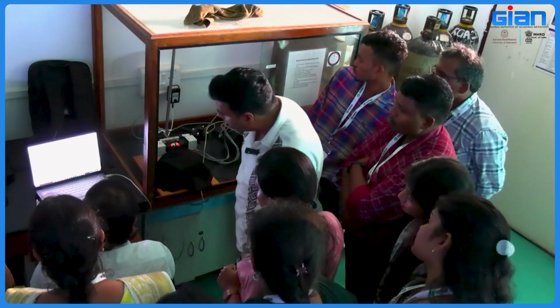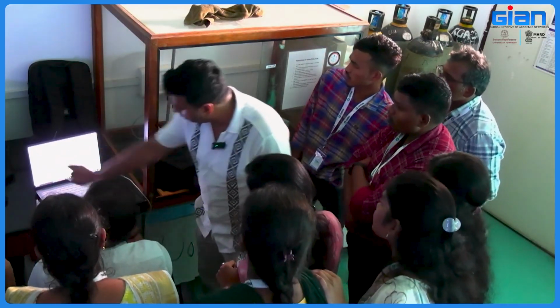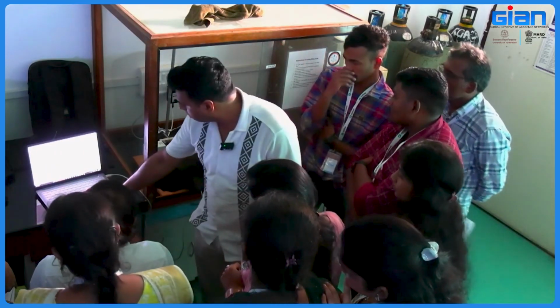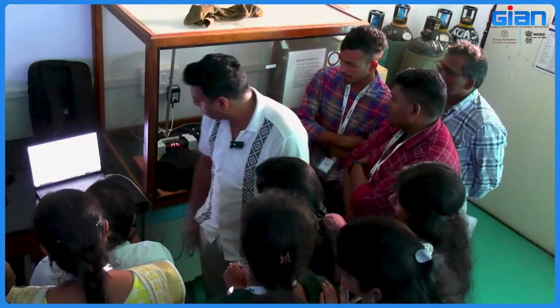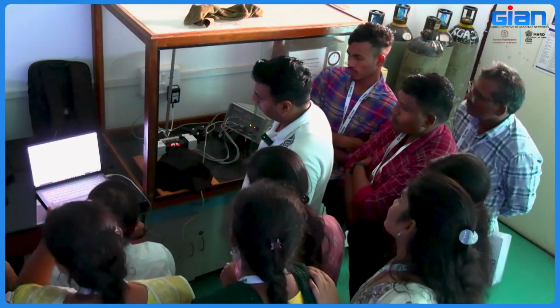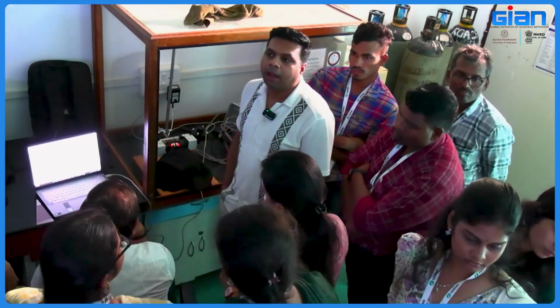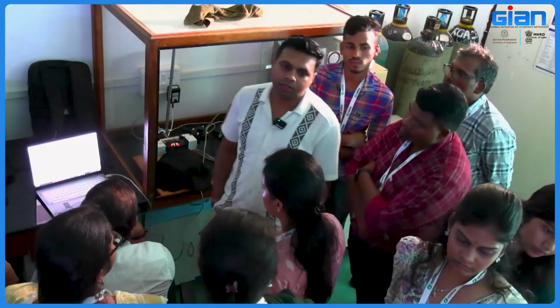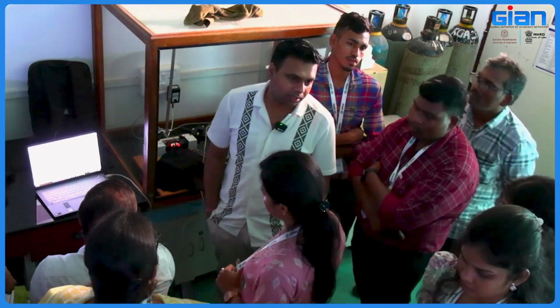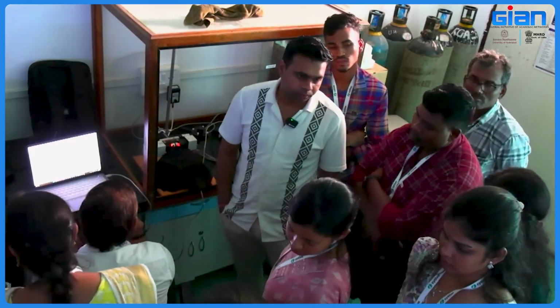So now the power is 111, right? Each saturating pulse will record a point. How long do you take the reading for one sample? It depends. If a 30 second duration is there, then you are giving like 10 or 14 pulses. Just multiply with 30 seconds. That many seconds you will have for each sample. Okay.